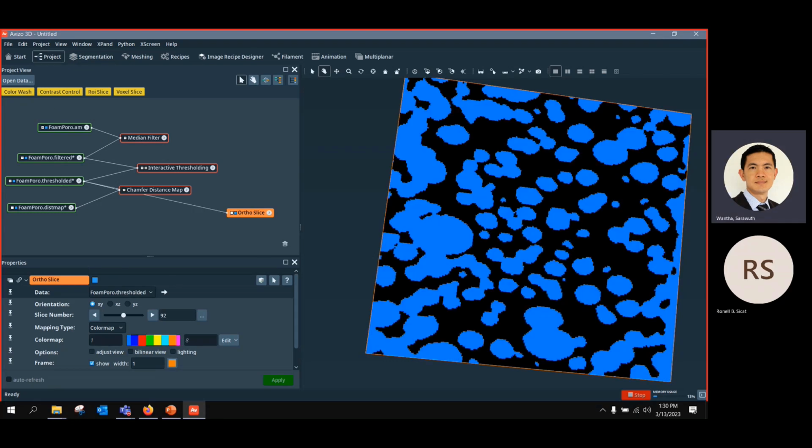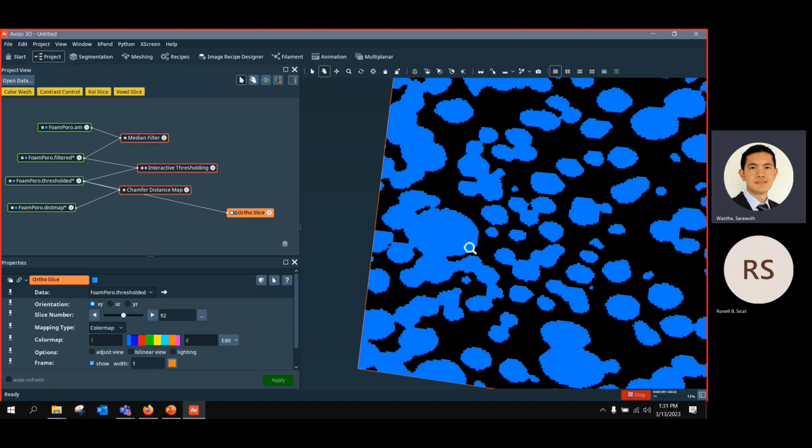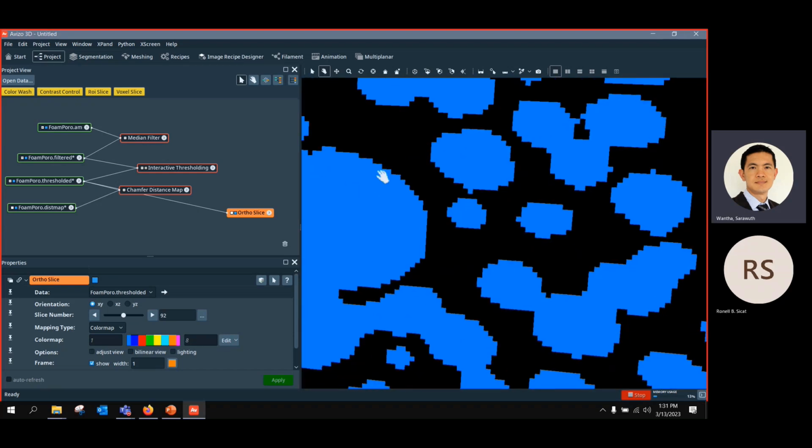So a little explanation. You have a label image like this. When you transform it into this distance map, they start from the outermost pixel at the border. They detect the pixel that has value of 1 closest to the border, at the border of each label, and the value of this pixel is transformed into 0, and then they propagate inward into the center.